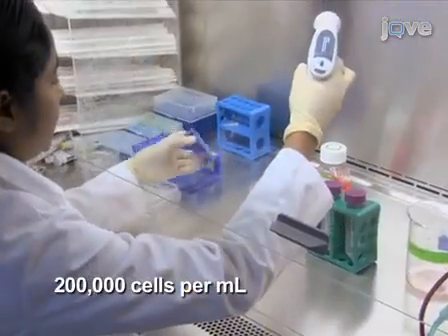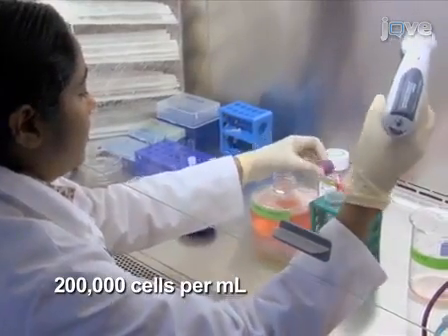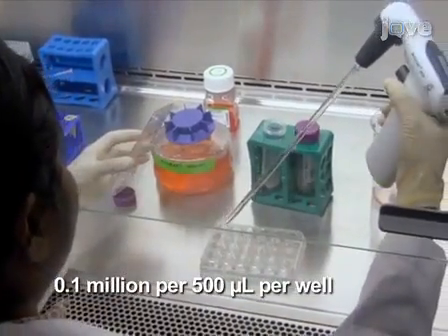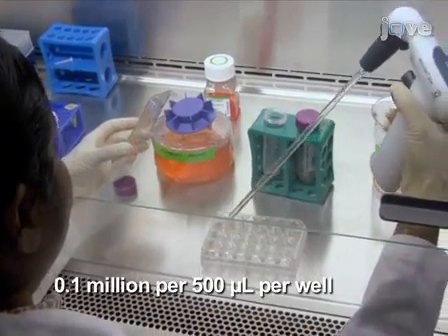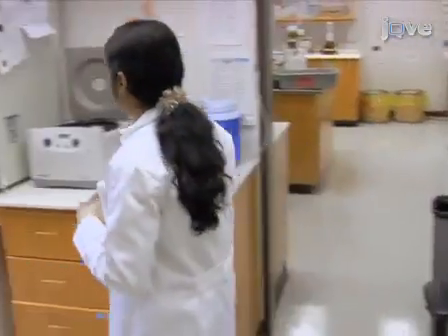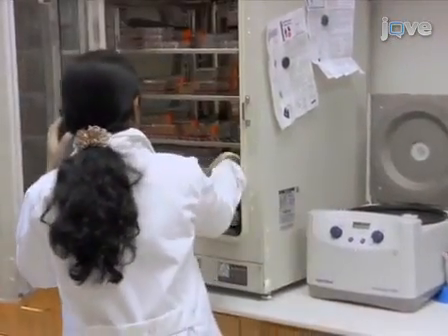wash and re-suspend them in regular growth medium at 200,000 cells per milliliter. Plate the cells in a 24-well plate at 0.1 million per 500 microlitres per well. Then, incubate the cells for 1 hour at 37 degrees Celsius to allow cells to recover from trypsinization.